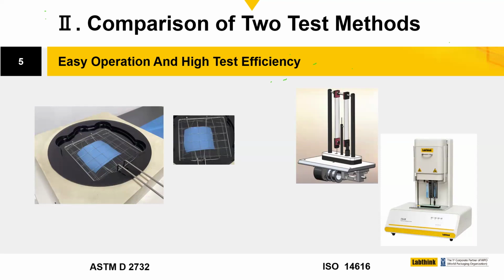With the other method, we have some different sensors involved, and it's a more mechanical method. So if you concentrate on the drawing rather than the picture or photograph of the instrument, you can see that there are two specimens there. Between the specimens in the diagram is a thermocouple which controls the temperature of the environment around the specimens. In the picture, one of the specimens is connected to a cable displacement sensor.